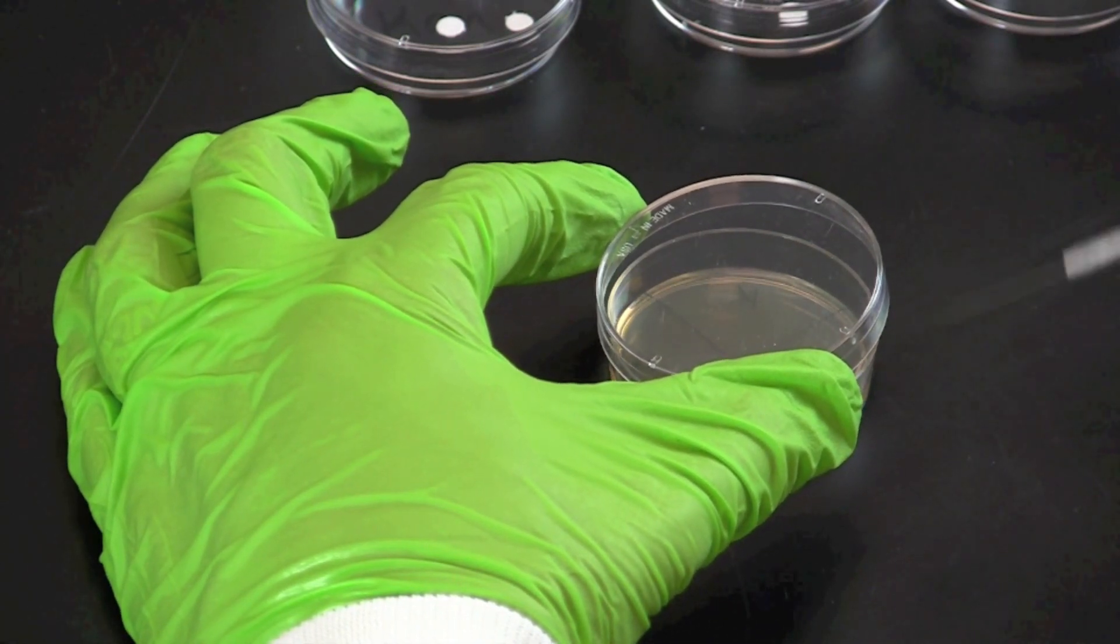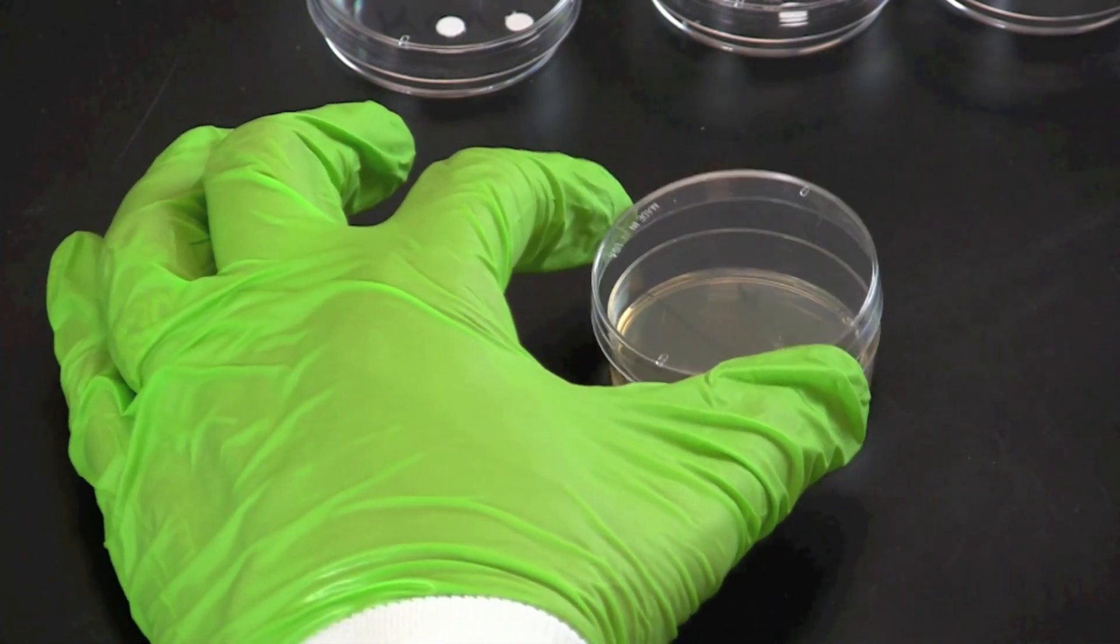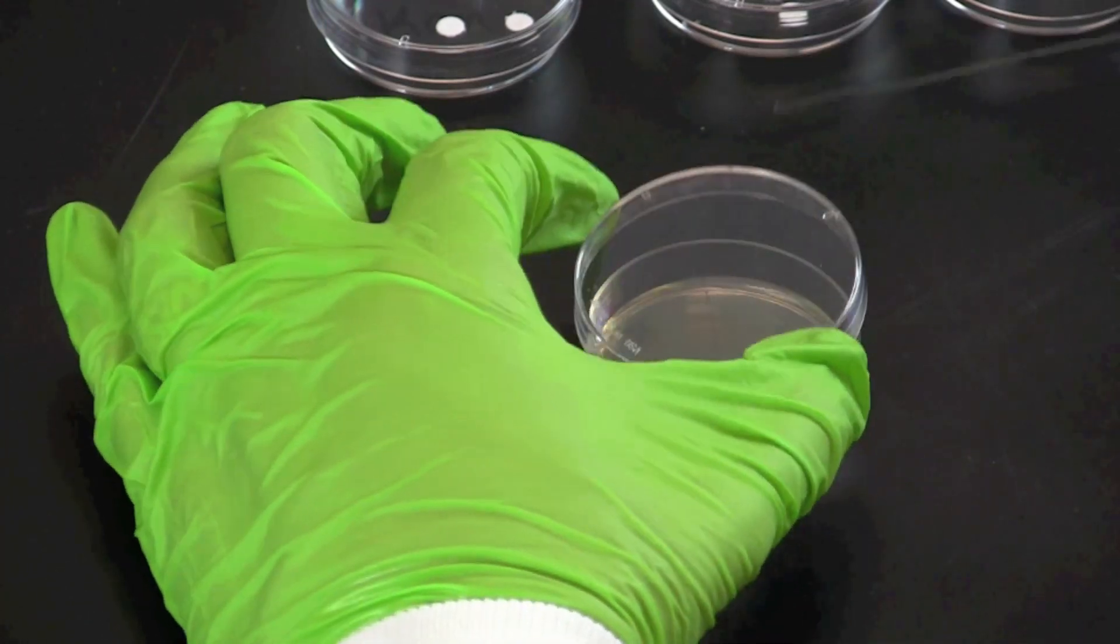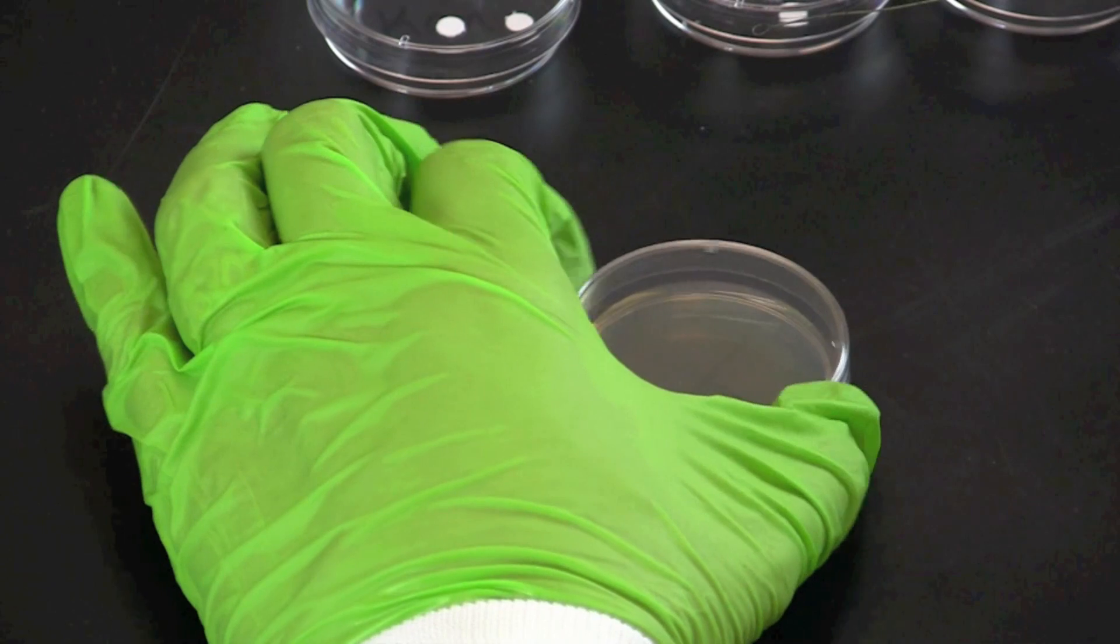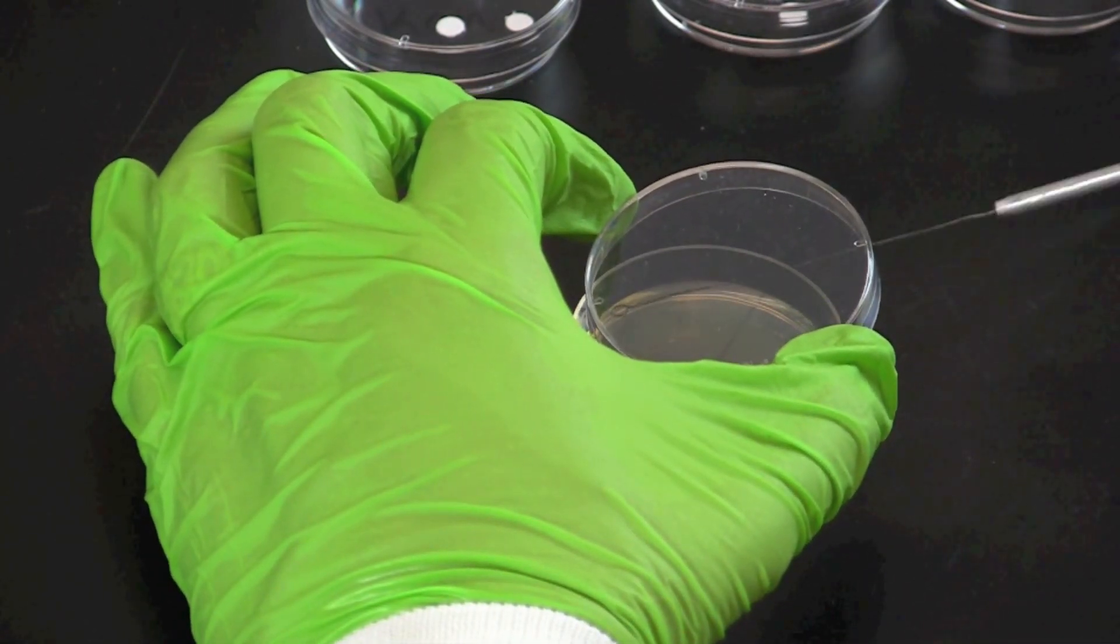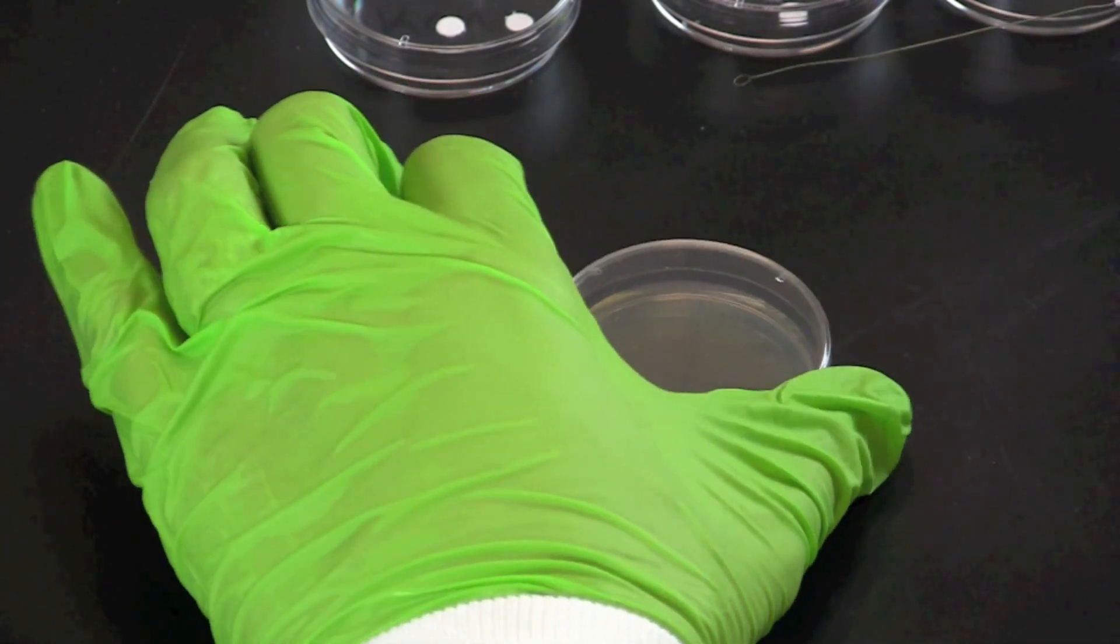Transfer the bacteria to your prepared plate. Spread the bacteria over the entire surface of the plate in all directions. Rotating the plate a quarter turn between spreads will ensure that the bacteria is spread evenly across the plate.